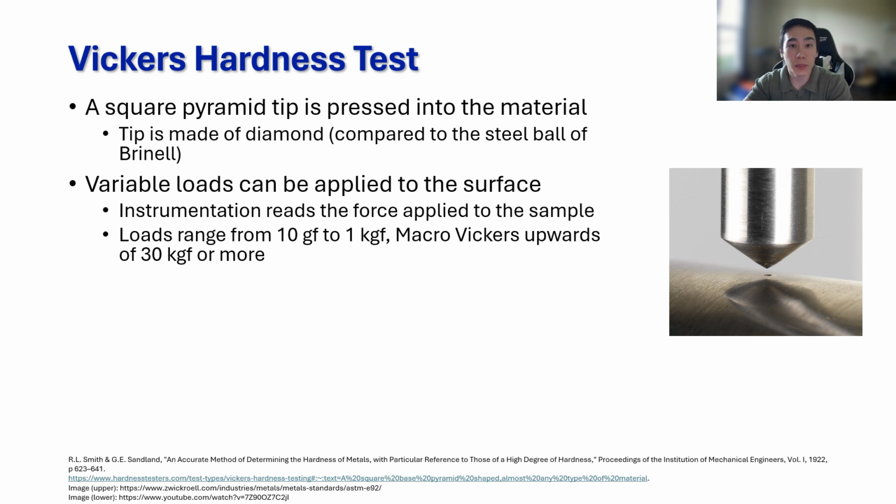It is important to be able to vary the load applied because even though for many materials the hardness is independent of the force application value, some have unique properties that cause their hardness to be influenced by the magnitude of load. Also, materials may simply respond better to higher or lower loads. For example, a polymer would likely not need nearly as much force applied as a ceramic to get a measurable indent.